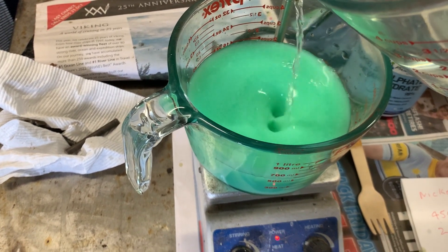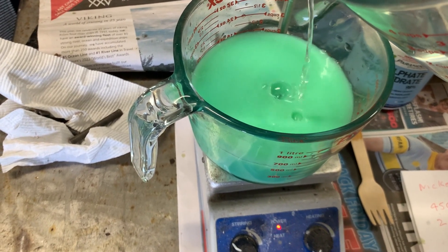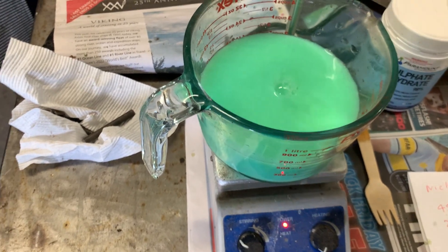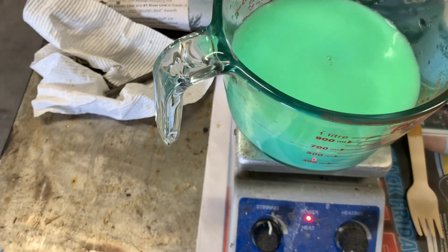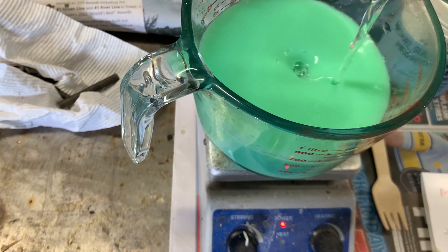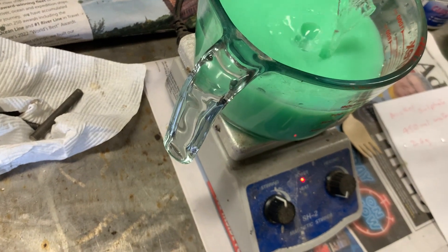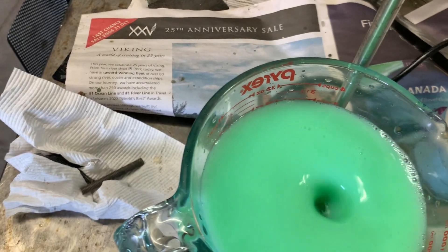It's getting thick. Increase the stirring speed. Now allow that to stir for about an hour or two.